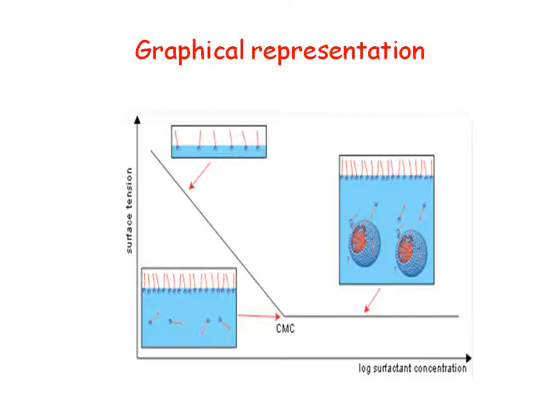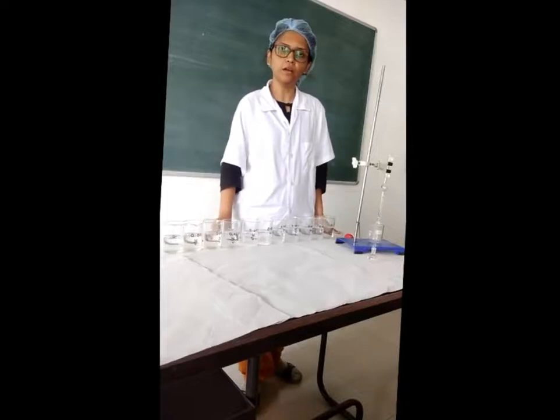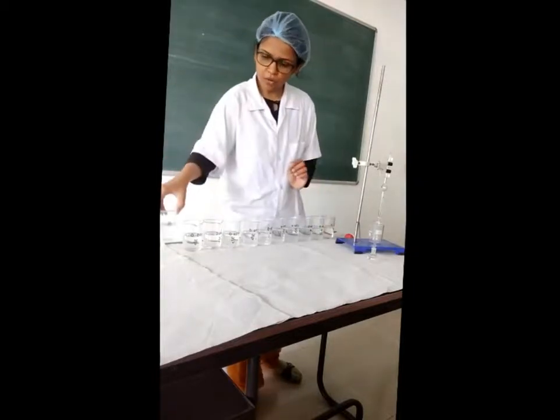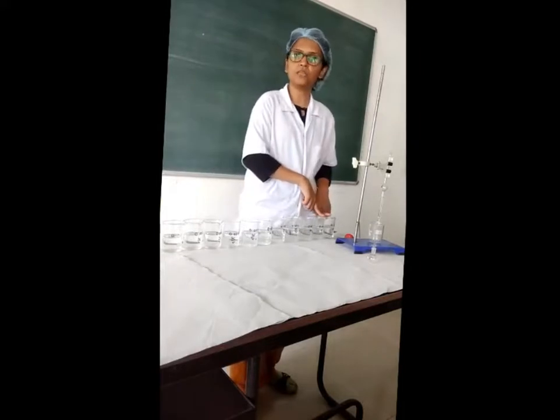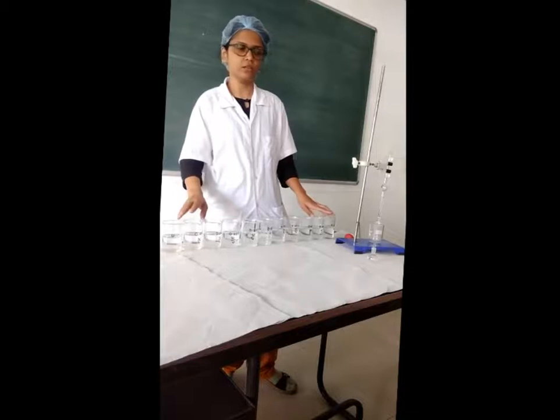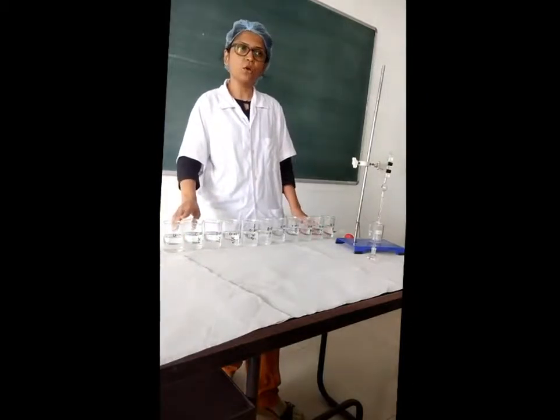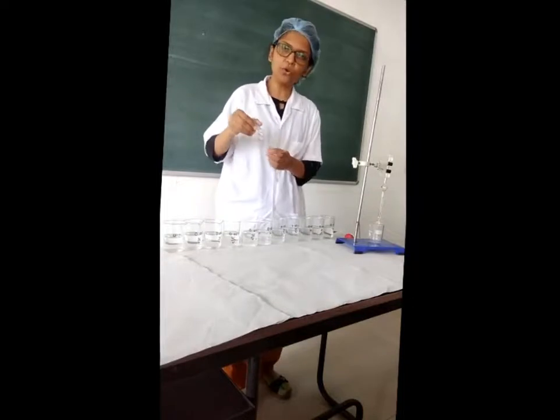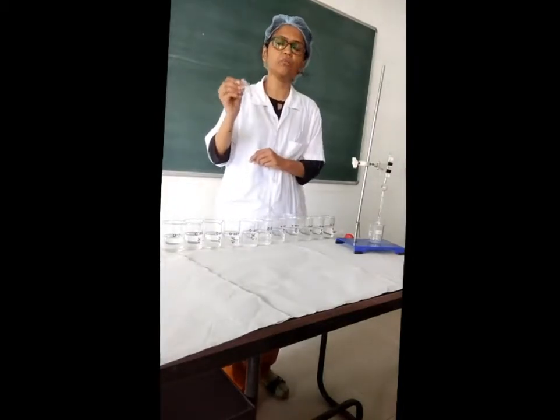Now we will see the actual practical demonstration of this experiment. First prepare different dilutions of surfactant — here I have prepared from 0.0% to 1% of different dilutions. To determine critical micellar concentration, we first need to determine the density of each liquid using this density bottle, which has a capacity of 10 ml. First take the weight of the empty bottle, then fill it with the liquid.